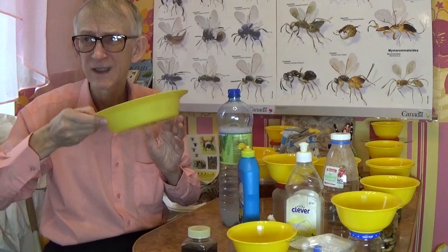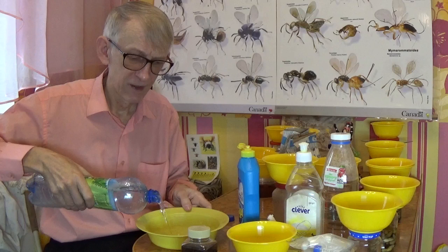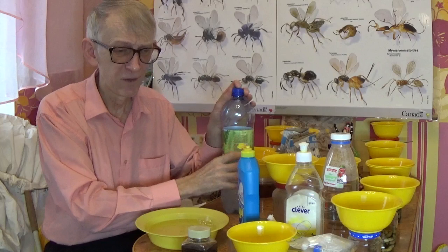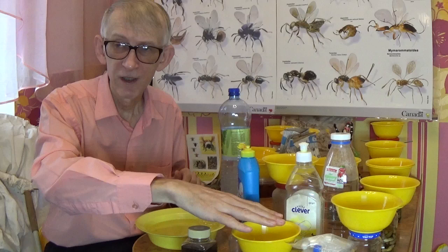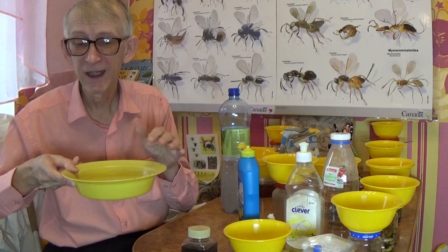Water evaporates, so sometimes half a plate is enough; you can fill it fully on your next visit. A full plate with water and salt can preserve the insects for a couple of days — insects will be salted and saved. After two days, on the third, you can come and collect the material.